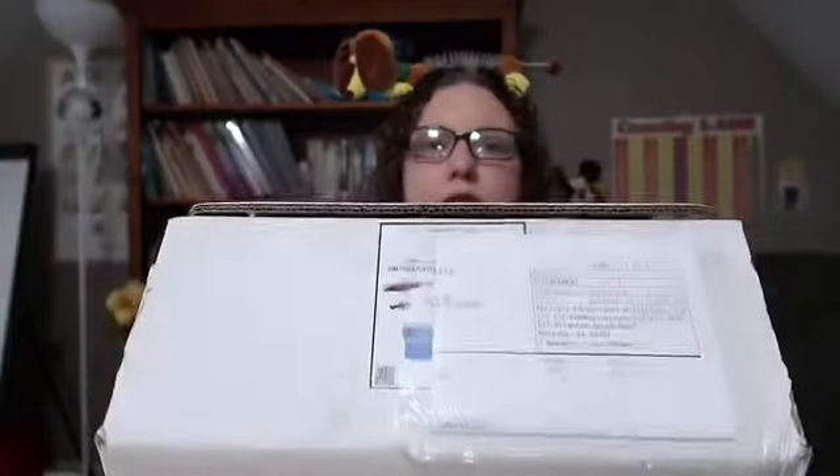Here's the box it came in. For the purposes of this video, I went ahead and split the tape and opened it, but I have not taken anything out of it. This is the Apologia Biology Dissection Kit. Let's dig in and see what's in here.